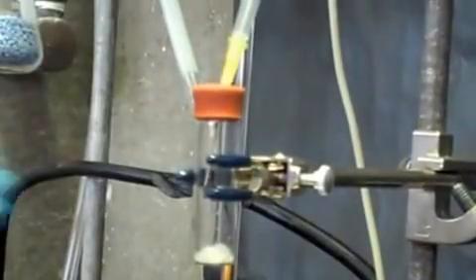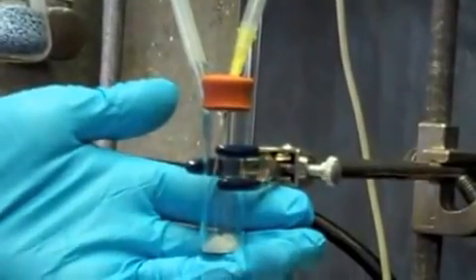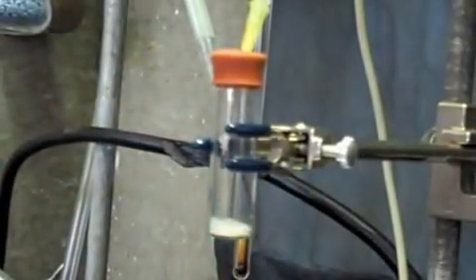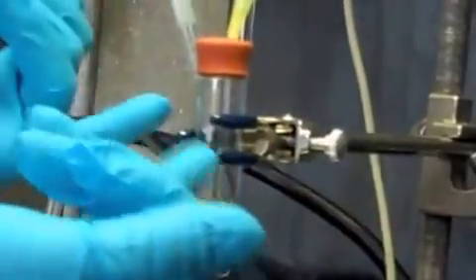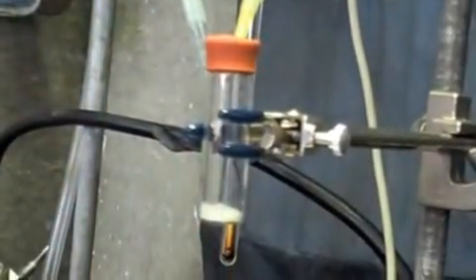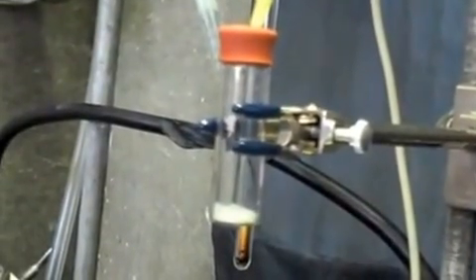Right now, there's a vacuum being pulled inside of this vial. When I switch back to nitrogen, it'll backfill with nitrogen. In this case, that's kind of a problem because our solid bounced everywhere and got on the sides. It's now on this needle, and this wouldn't be good because all of our stuff won't be in the solution for the titration.